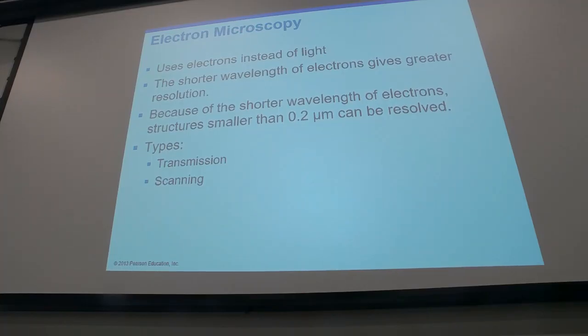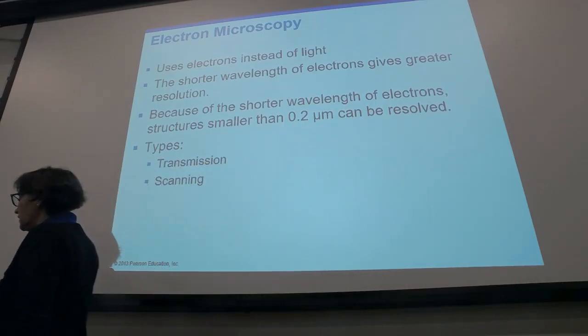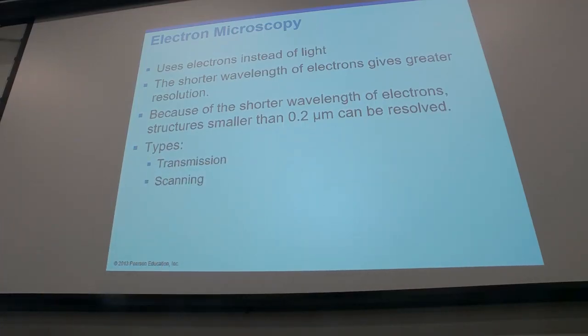And now, for electron microscopy, which are very sophisticated microscopes, you use a beam of electrons to hit the object. They're caught by detectors of these rebounding electrons, and then you can obtain high resolution of internal structures or of the surface of these objects.